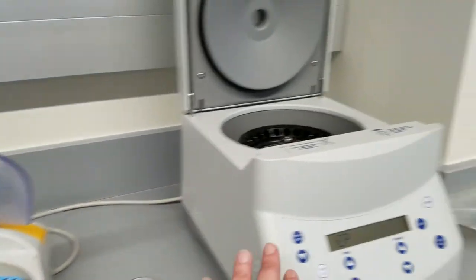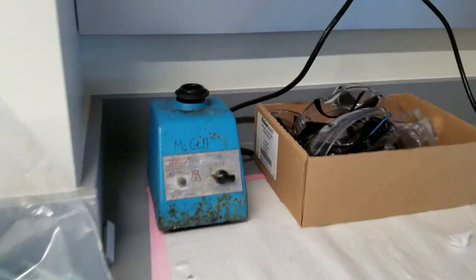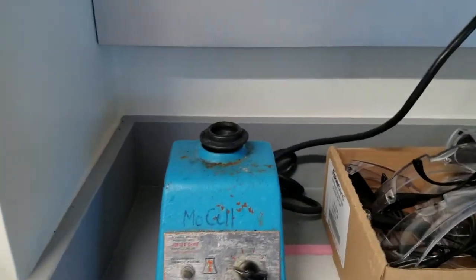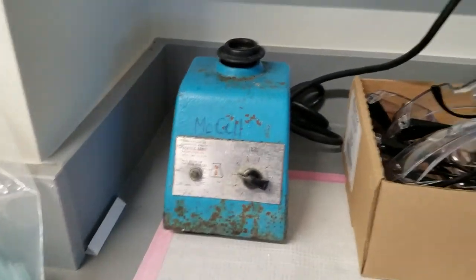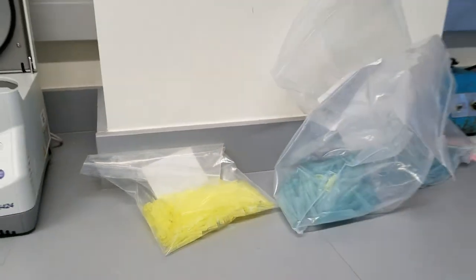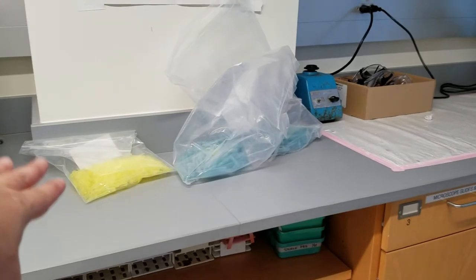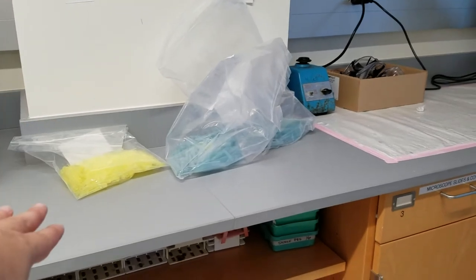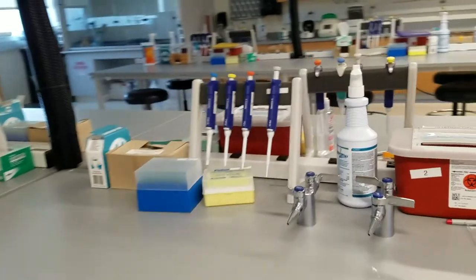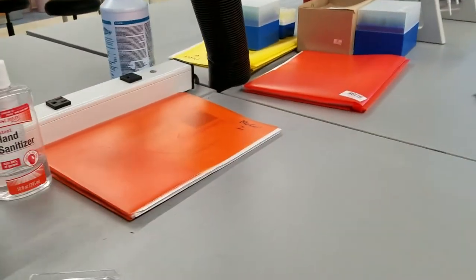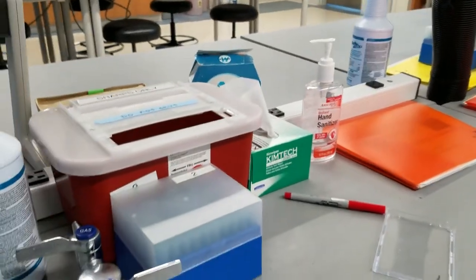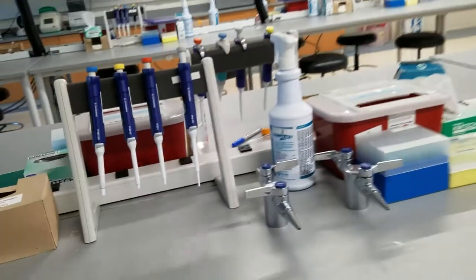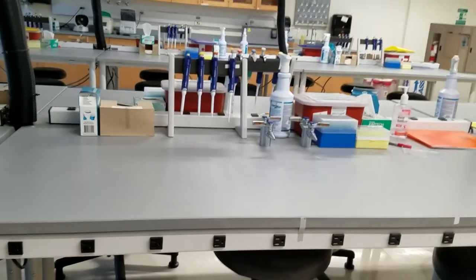At the end of the day, students are required to fill up their pipette tip boxes with provided pipette tips. We autoclave them as needed so that students can have clean pipettes, but they are required to fill the boxes of these pipette tips and to clean up their benches as they leave before at the end of each lab.